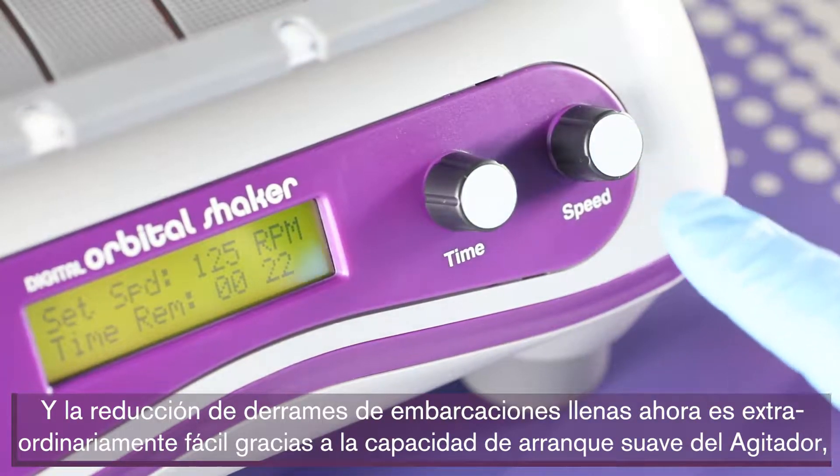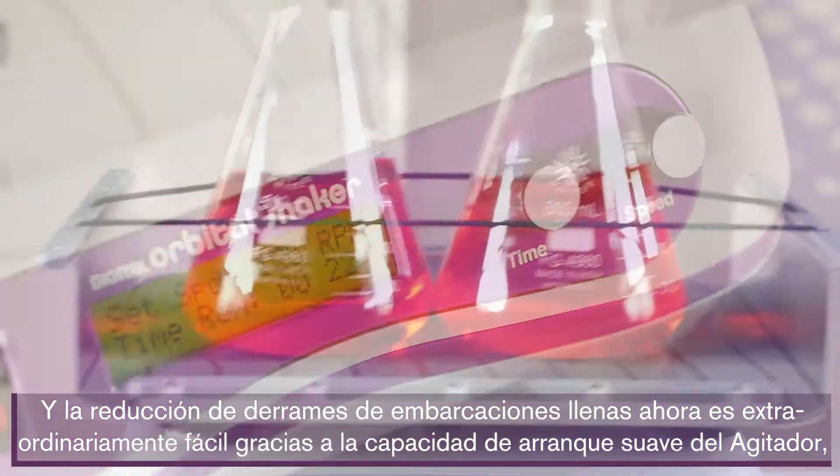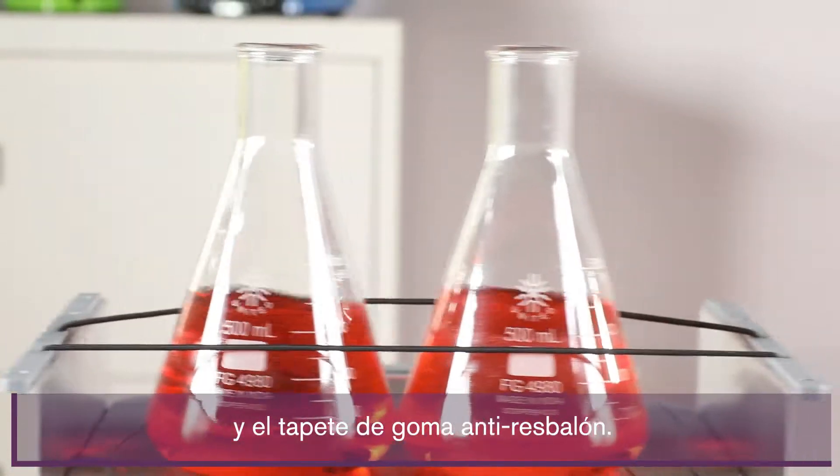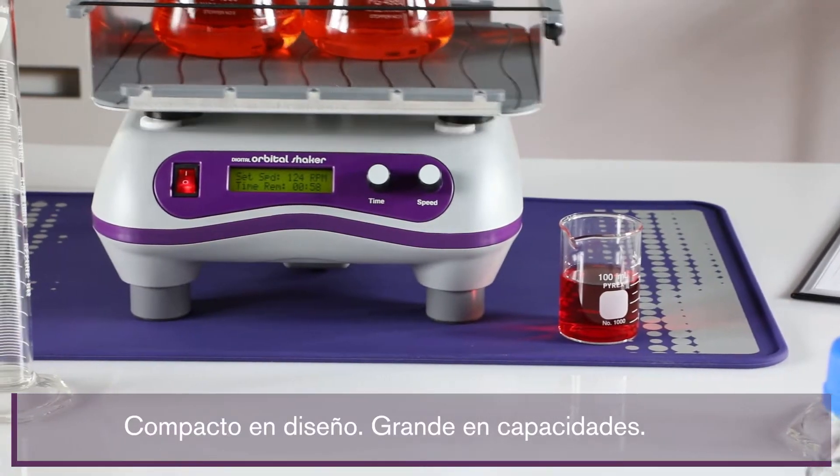Reducing spills from full vessels is now remarkably easy thanks to the shaker's soft start capability and its skid-free rubber mat. The Digital Orbital Shaker: compact in design, big on capabilities.